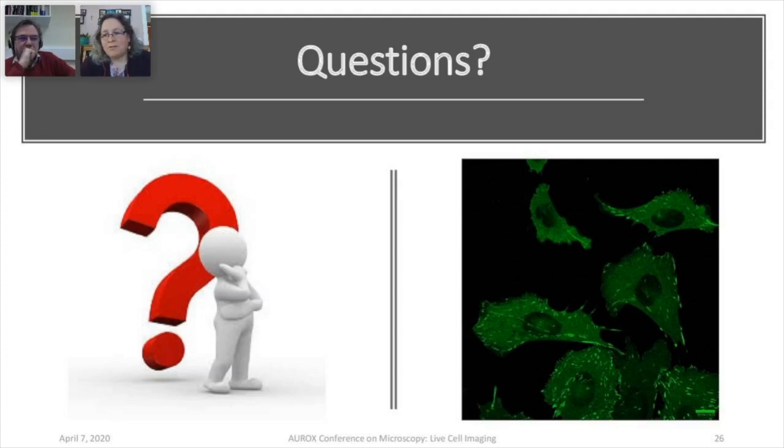I see a question here from Ian Doby of whether the 0.4 millisecond rise and fall time is actually a property of our oscilloscope sensor, that light sensor, more like it. Yes, whether that's the time limit of that sensor, and it's very possible, because the number we got for the lasers was almost identical. So I could look into that. I don't know off the top of my head the time sensitivity of the sensor.